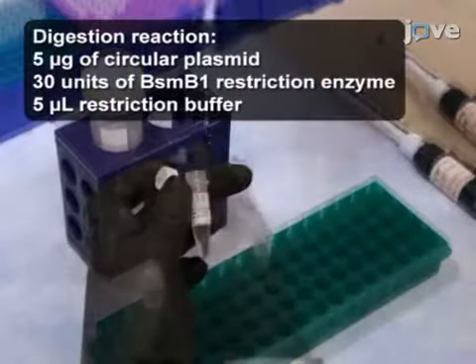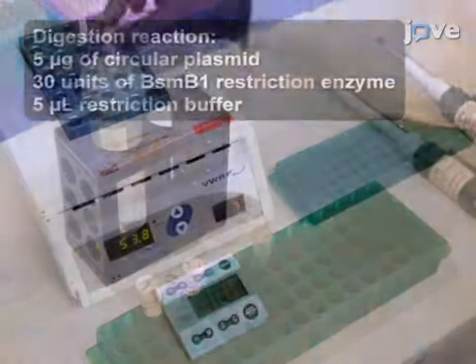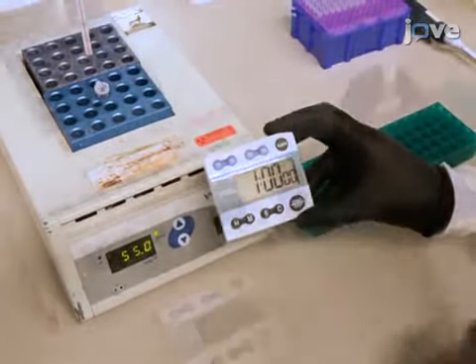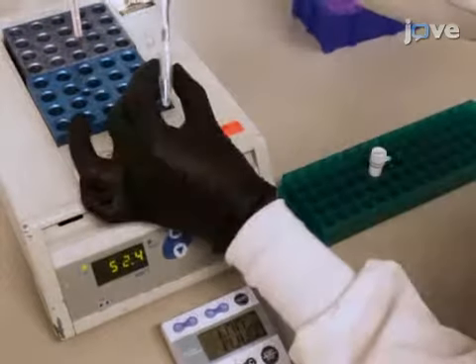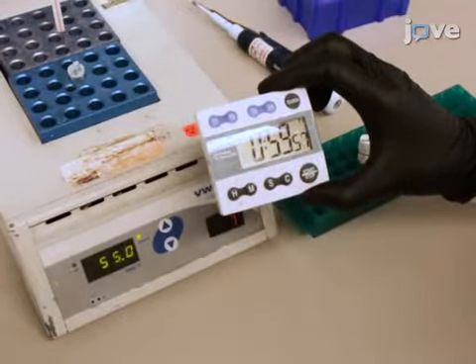To digest the lentiGuide-Puro vector, prepare 50 microliters of digestion reaction. Then, start the digestion reaction at 55 degrees Celsius in a heat block. After 1 hour, add an additional microliter of BsmBI restriction enzyme and continue the reaction for another hour.